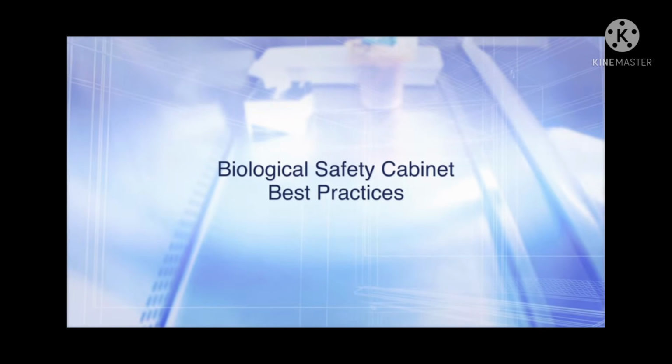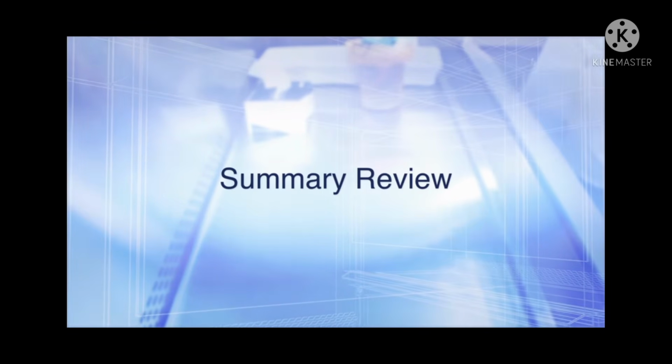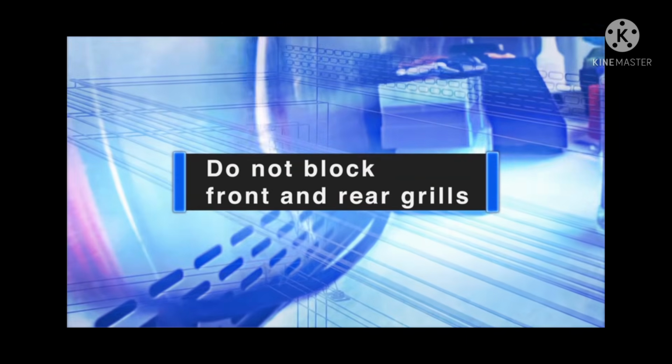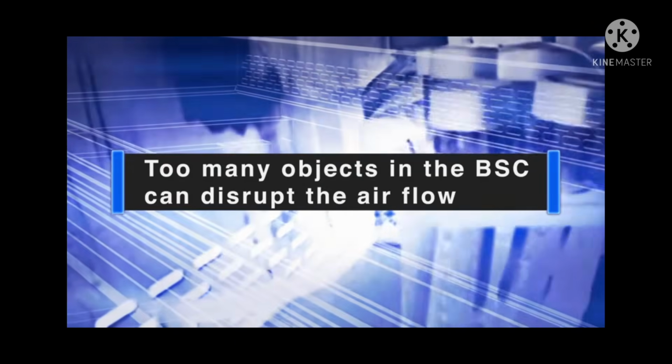In summary, there are a small number of best practices to follow in using a biological safety cabinet. Let's go over them one last time. Work at least 10 centimeters inside of the BSC. Do not block front and rear grills. Too many objects in the BSC can disrupt the airflow.